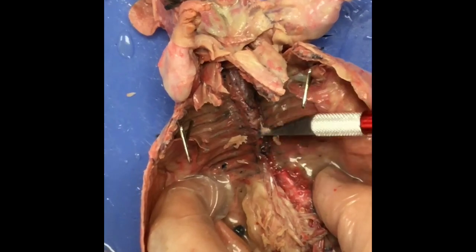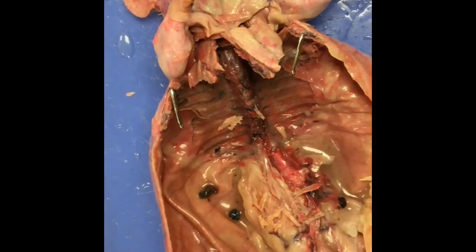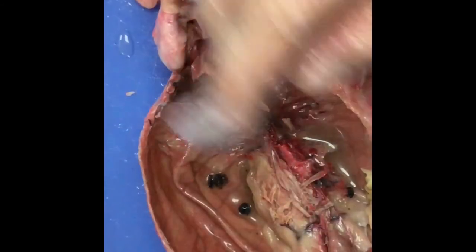All right, so here you can see that spine running down. I'm going to trace that up into here. And do you guys want to see the brain? Yeah. Amy told me that the brain is the best part. And it is pretty awesome.